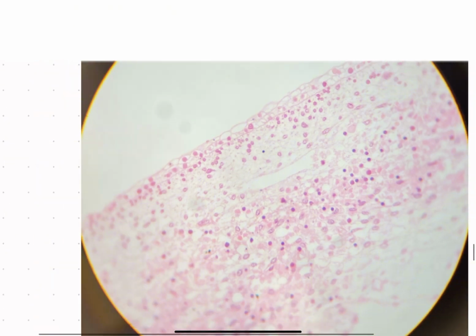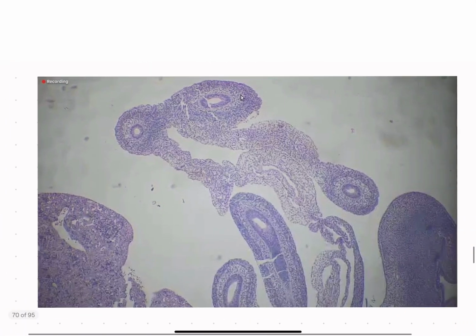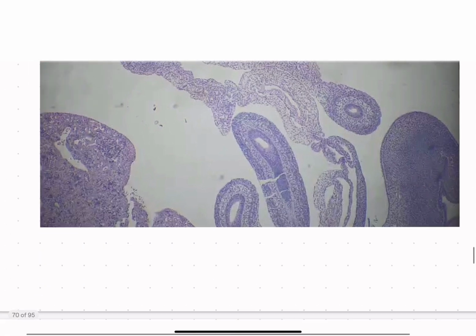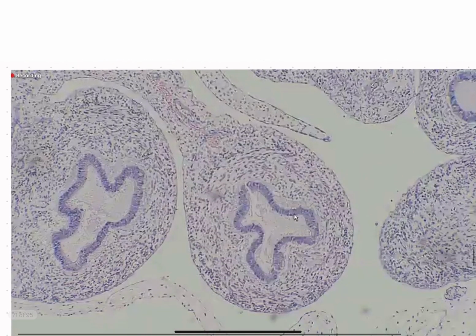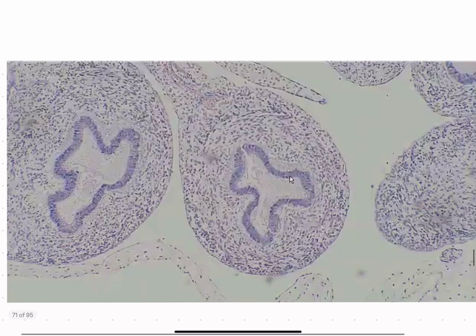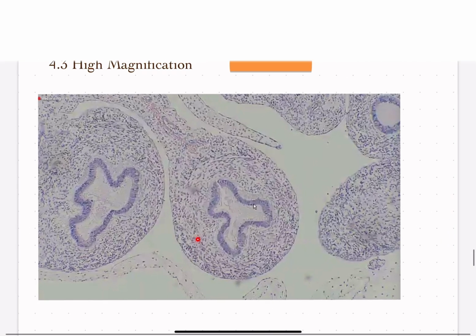Okay, next slide. We see something like this. I'm not going to show you anything else though, because I hope this will be enough of a tell of where we are. So zooming in, we see this. So we've zoomed into one of these areas, and I know this is a completely different picture, but this is what we see. Please tell me what this is called.